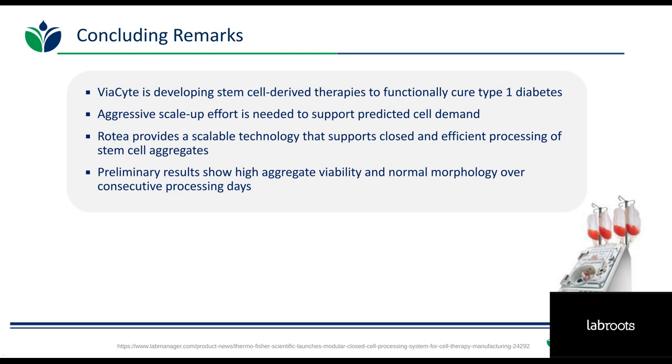All right, thanks again, Mary Ann. Our next question, can single-use kits be reused for testing purposes? Yes, you can reuse single-use kits for testing purposes, but it is important to watch the integrity of the pump tubing and to clean out the tubing and counterflow centrifuge cone after each use to remove any debris or any adhered aggregates or cells. However, these kits are advertised as single-use, so the official recommendation for use with the final process is not to reuse the single-use kits.